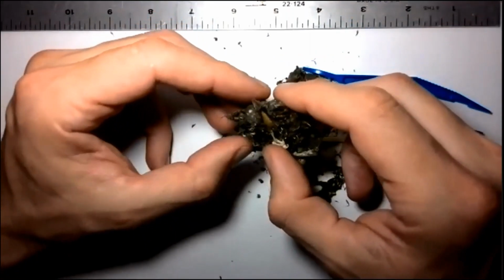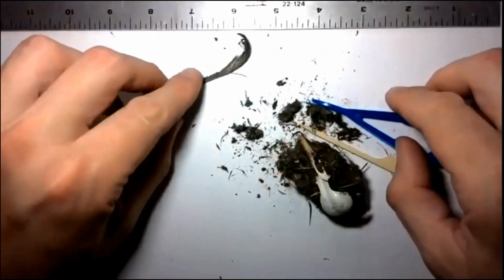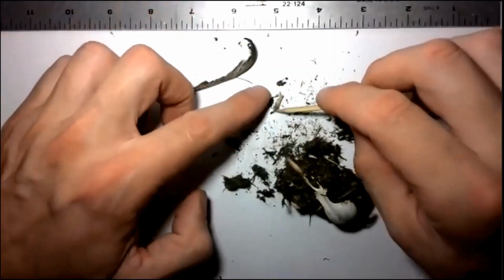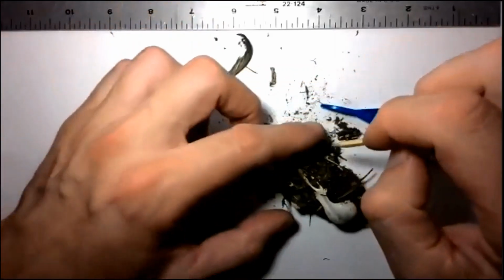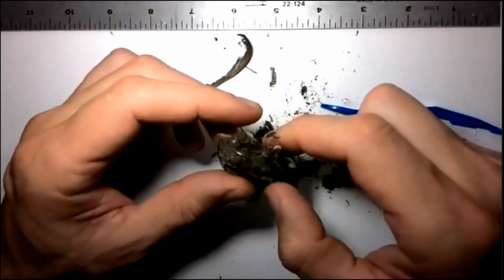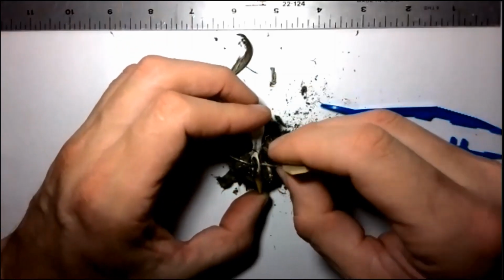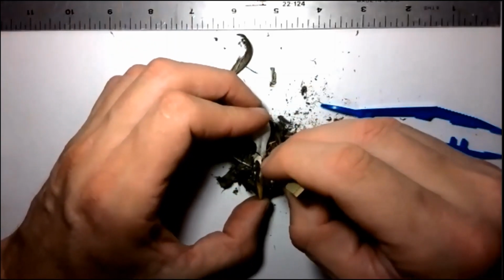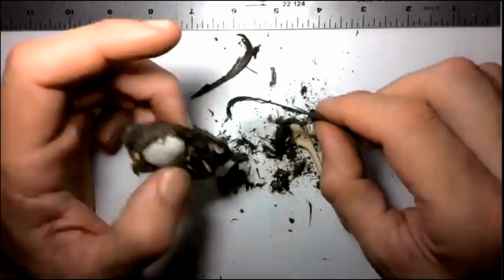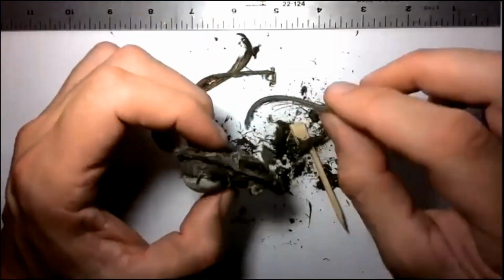All right, this is really, really compact. In case you had doubts that we have a bird, look at this. And we have already some feathers. One feature, if I hadn't found the skull right off the bat like this, knowing that we have a bird in the menu of this owl: bird bones tend to be very light and fragile. Remember, they have a lot of air chambers because they have to be extra light for flight. So it's very unique to hold a little femur or leg bone of a bird in your hand compared to a rodent of a proportional size.